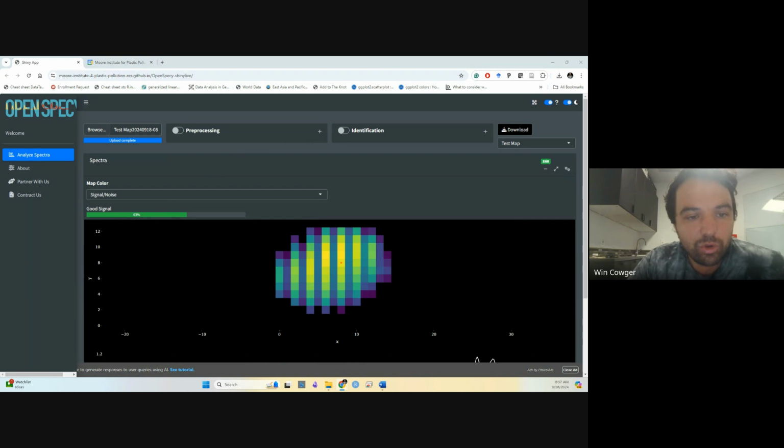All right, we may not get all the way through everything today, so we'll definitely have another training on hyperspectral image analysis that'll go into more depth on some of these topics too.